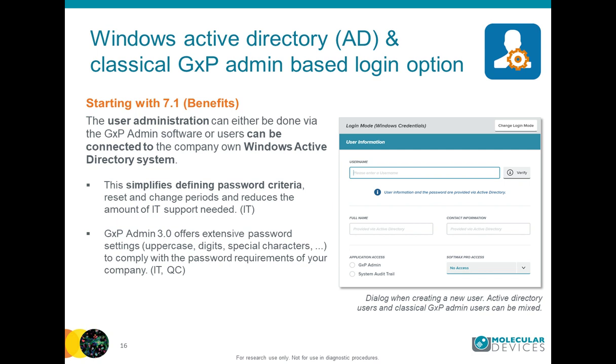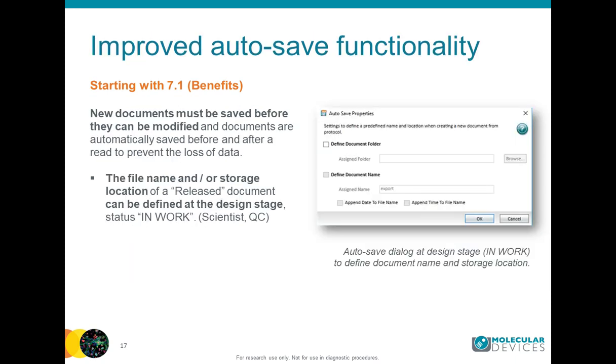The benefits of having such an Active Directory system is that it simplifies defining password criteria because they're determined on a company level. But if you don't want to use Active Directory, we have also expanded the password definition criteria for 7.1.